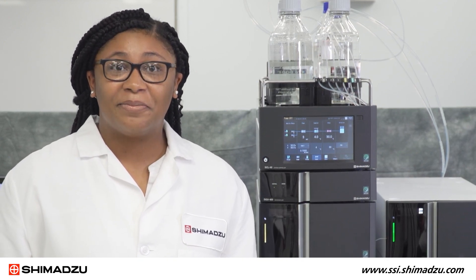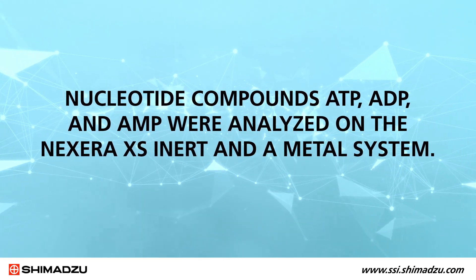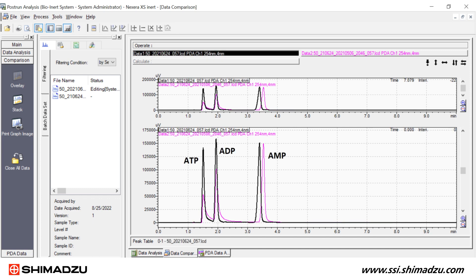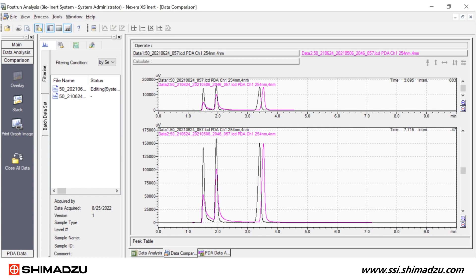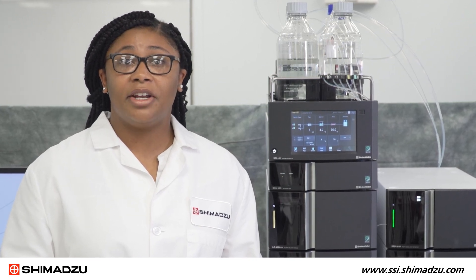Now that we have covered the system configuration, let's look at some comparative data collected on the Nexera XS Inert and an equal but metal-containing system. Nucleotide compounds ATP, ADP, and AMP were analyzed on both systems. Here we have an overlay of two nucleotide datasets. Data collected on the inert system is shown by the black trace, while data collected on the metal system is shown by the pink trace. As you can see, there is increased peak height and significant reduction in tailing on the inert system. This data demonstrates the performance and ability of the Nexera XS Inert to improve separation and sensitivity of nucleotide molecules.